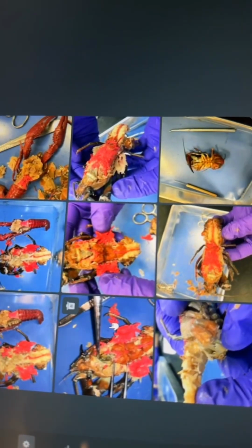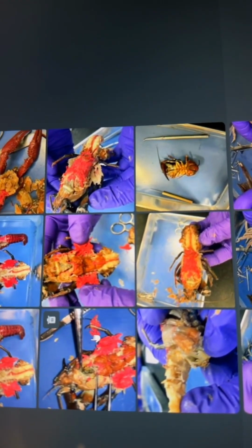for easier digestion. The stomach is going to sit around this area, and this is where the food's going to be digested, and it's going to receive a lot of absorption of nutrients higher up into this part from a cecum, and then after that has been digested, it's going to pass out actually through the back, the dorsal side, through an anal tube. Next, we're going to take a look at the circulatory system of the crayfish.